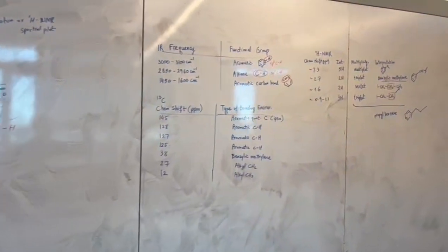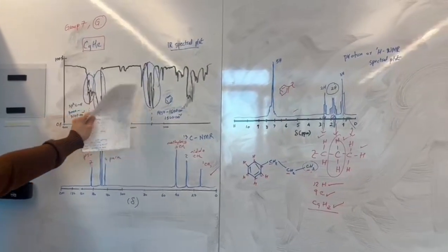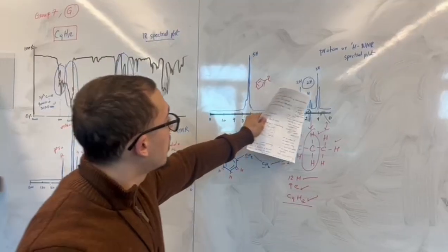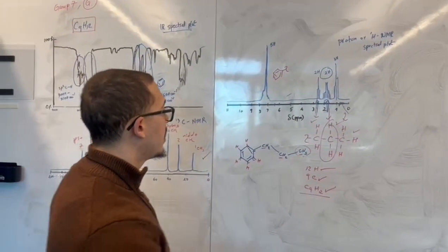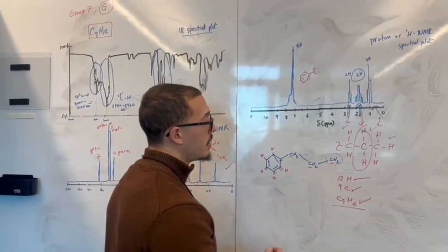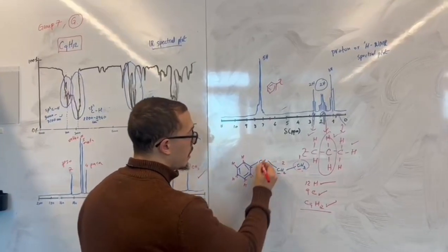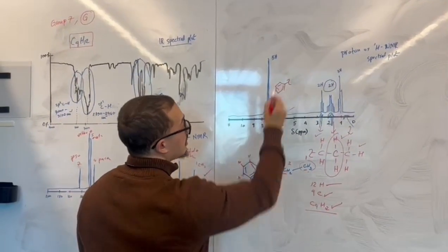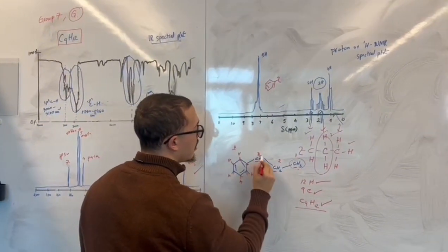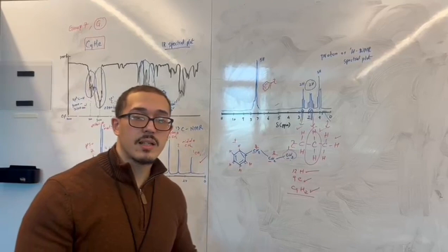Right there. So that is good. Make sure we have those 3 functional groups, as well as our 4 hydrogen environments. Let's see if we have the same 4 hydrogen environments. So that's 1, that's 2, that's 3, and these 5 hydrogens fall under this environment right here. So that's 4. Without reasonable doubt, C9H12 is very much likely to be propylbenzene.